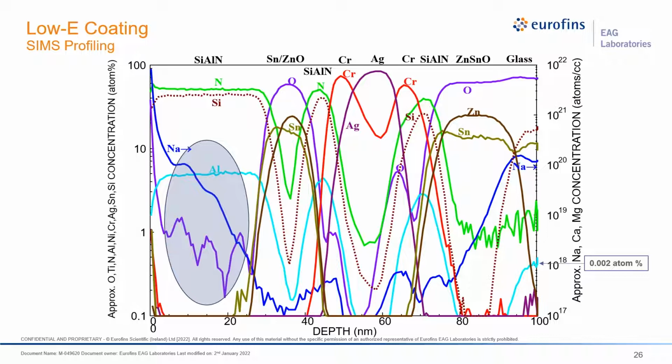And they are protected by layers around them, these conductive and transparent layers around these metallic layers. What is needed is to know if the deposition of these layers is following the desired manufacturing, and the thicknesses of these very thin layers.